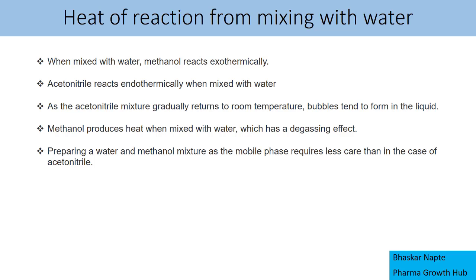I hope you now understand the challenges and the differences between using methanol and ACN while preparing the mobile phase.